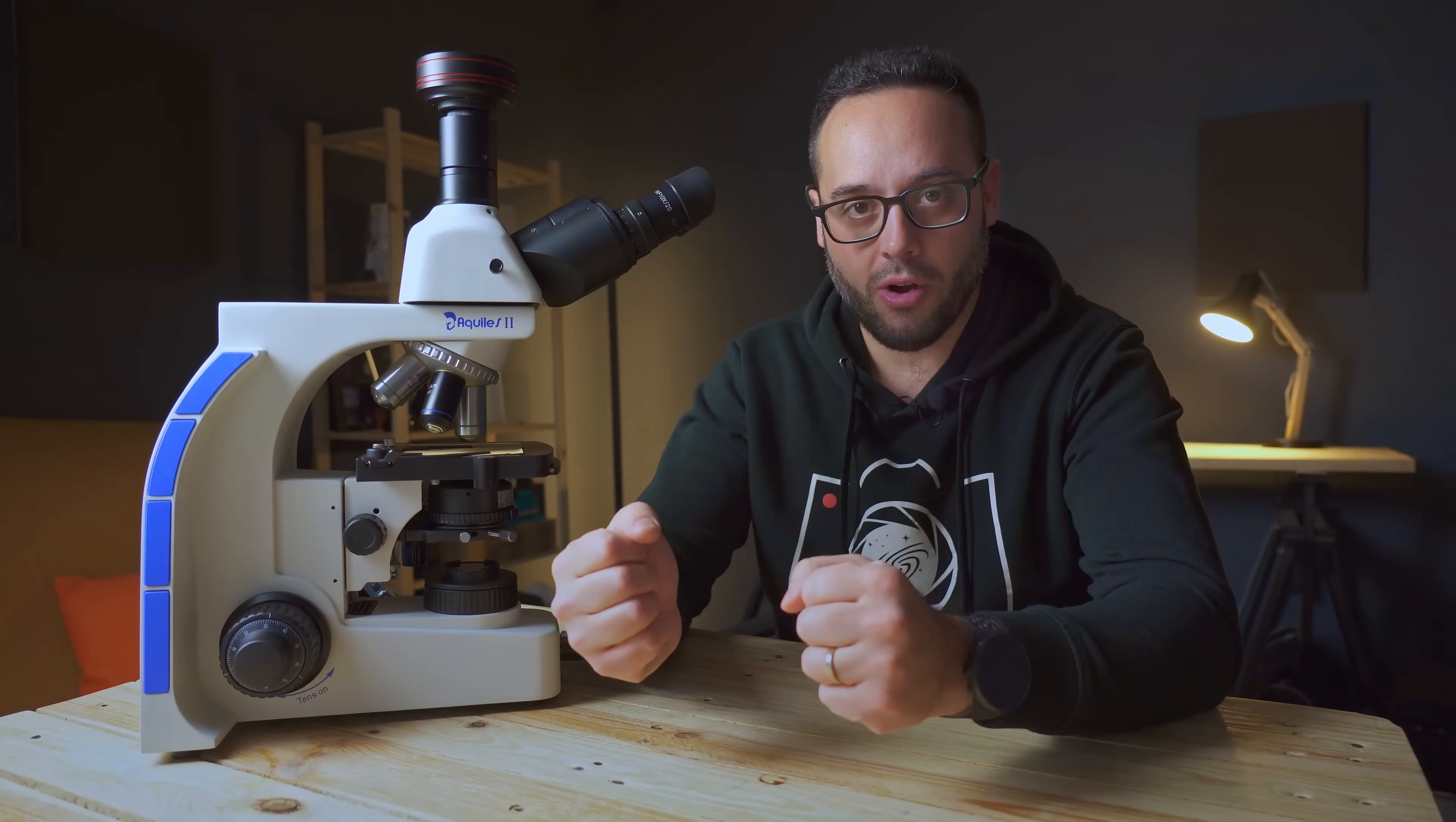And I'm going to be totally honest with you. Just as I've been practicing astronomy and astrophotography for 20 years and today I can assemble and operate a telescope almost with my eyes closed, this is the first time I'm in front of a professional-grade microscope like this. So learning to master all this and use it correctly to capture good images is going to be a small challenge.